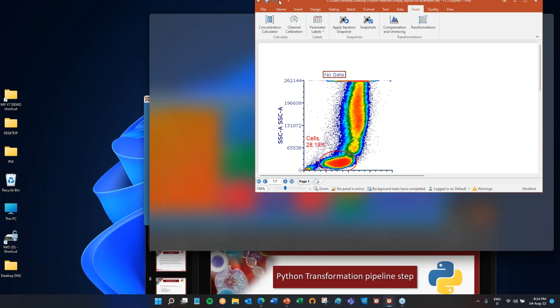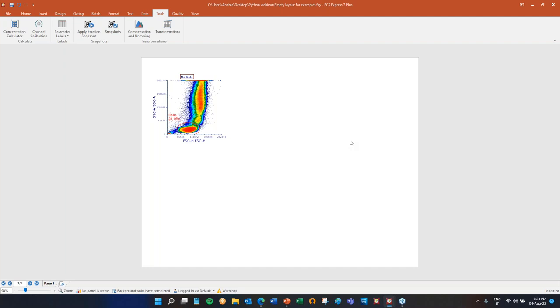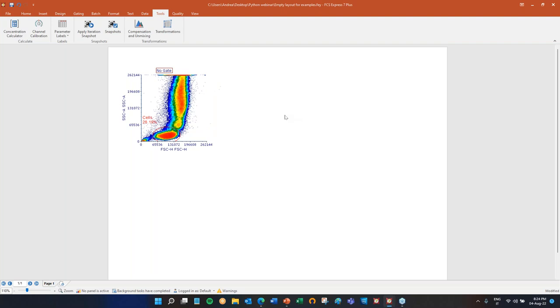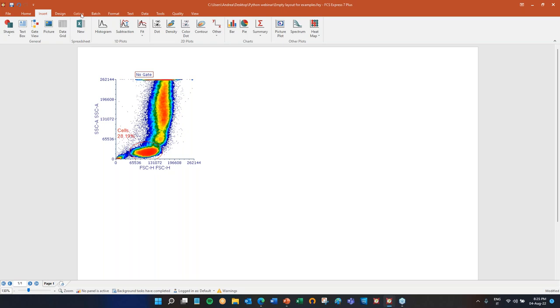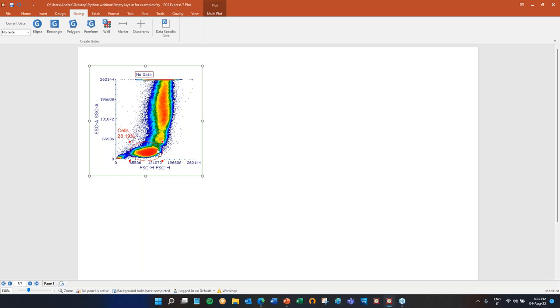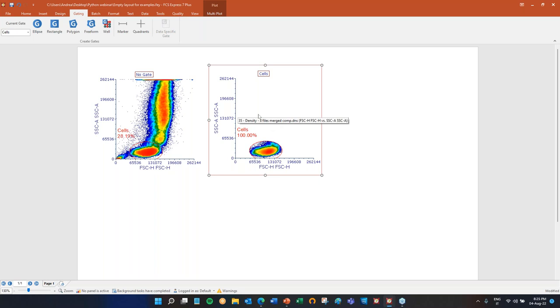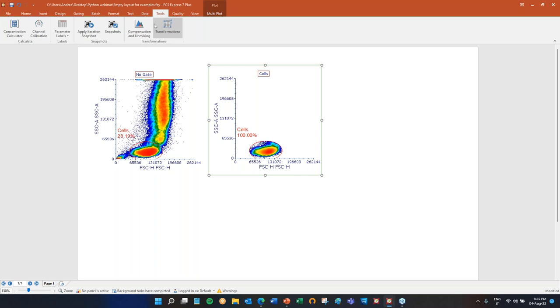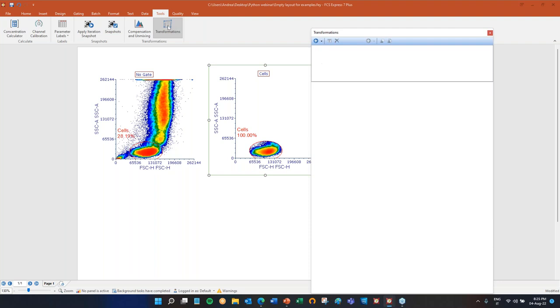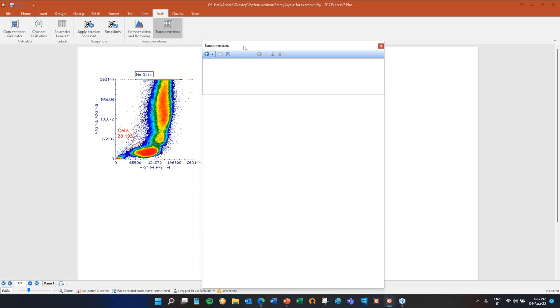This is a blank layout of FCS Express. For those not familiar, it's really similar to PowerPoint but it's FCS Express. Everything gets done from the ribbon bar — if you want to open plots, go to the Insert tab; if you want to create gates, go to the Gating tab. I've already created some plots and a gate. We will work with the cells gate — those are lymphocytes. Simply drag and drop the gate out.